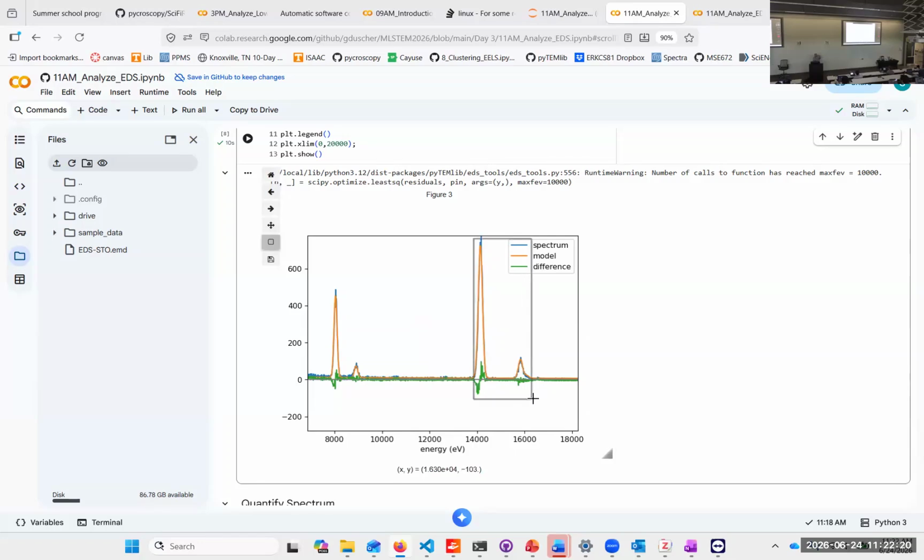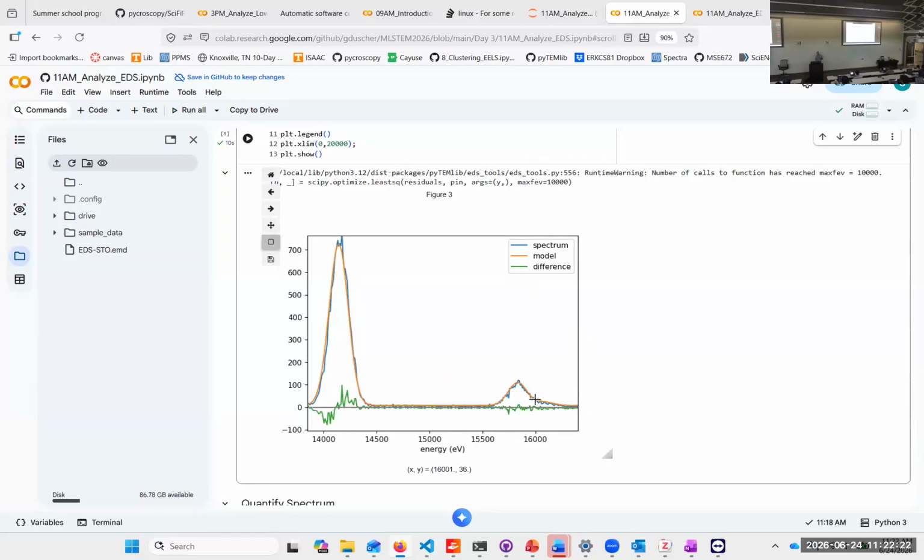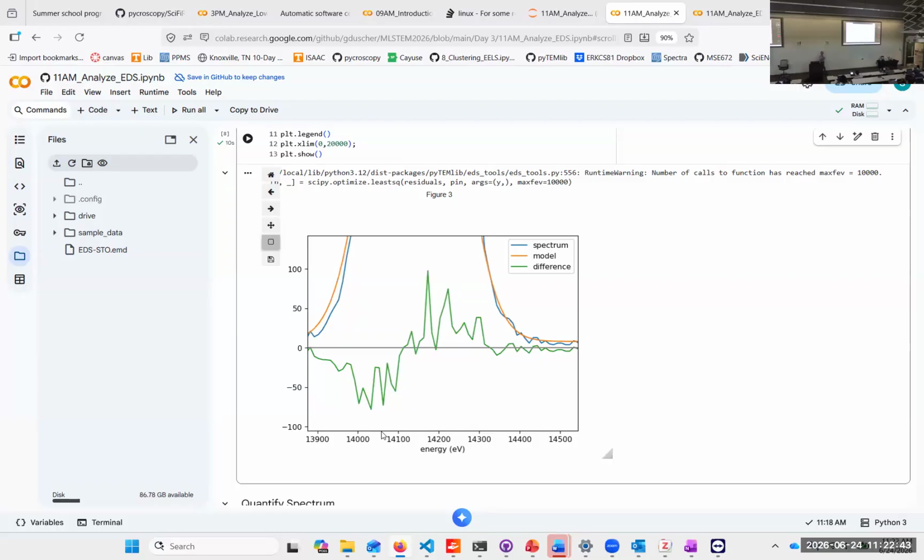Both of them, the whole family here works. There are a few smaller ones along the line, but they are probably too small to be seen, but they would be taken out as well. The position is not accurate. We see that because we have a kind of differential signal here. So my energy scale is not exact, but if you look at the error, it cancels out, right?